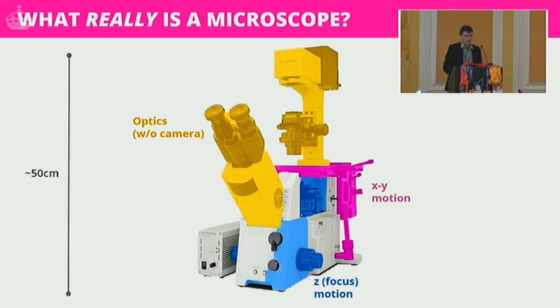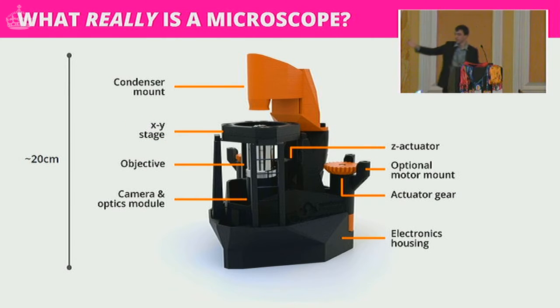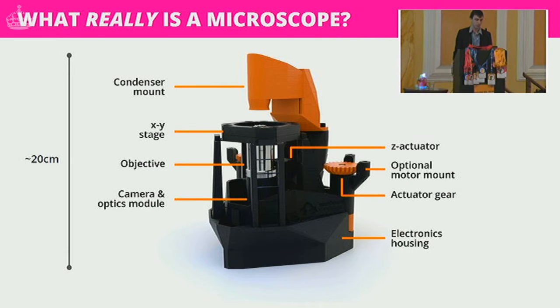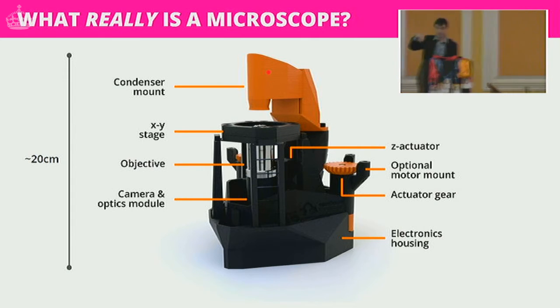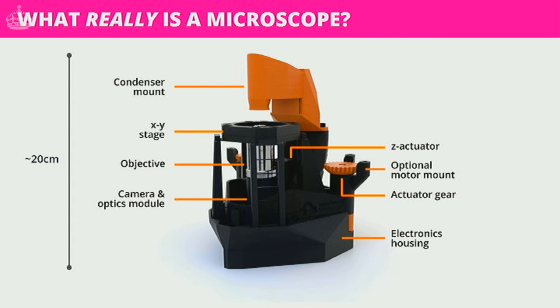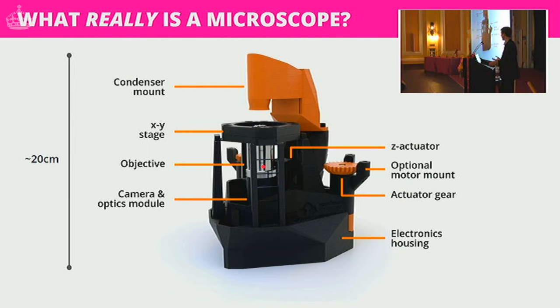Almost all of a microscope's weight is just mechanics, which raises the question: what could a microscope be? This is our microscope — it's a lot smaller than traditional microscopes and doesn't really look anything like one, but all the key parts are there. The condenser is where your illumination — your white light — sits, with a lens that focuses that light down onto your sample. The objective here is just a normal off-the-shelf microscope objective.